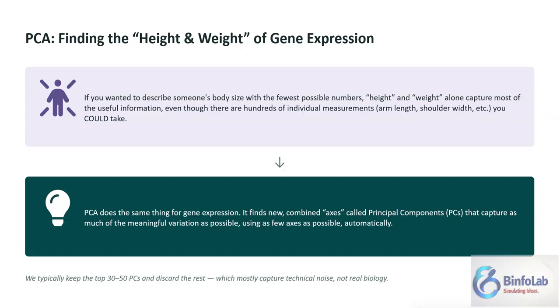So the most variable PCs are the starting, initial ones. That's why we will always select the initial PCs.